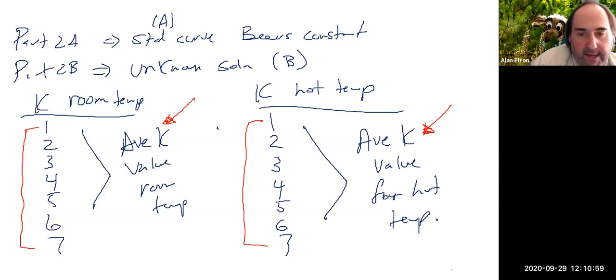Okay, so remember that you should probably already have the Pasco software downloaded. It's the same one that we use for the kinetics experiment. Again, a reminder that there is one Pasco file. That file contains both the absorbance versus wavelength graph and also the absorbance values for part A, the standard graph.